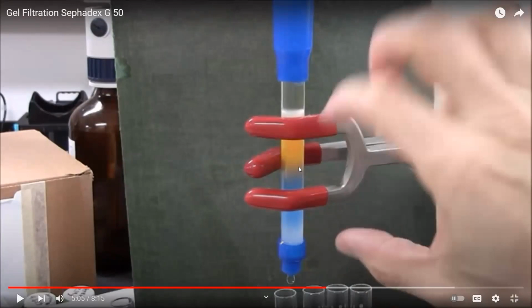So yes, in the last class, I told you that distinct separation must be achieved. Now, this is not distinct separation because they are still sharing the boundary. So the conclusion is that probably the amount of the sample that was loaded on this column was very much higher as compared to the capacity of the column. So there is a ratio also. If the column is smaller, then you cannot load too much volume of your sample. If the column is small, then the volume also has to be small.